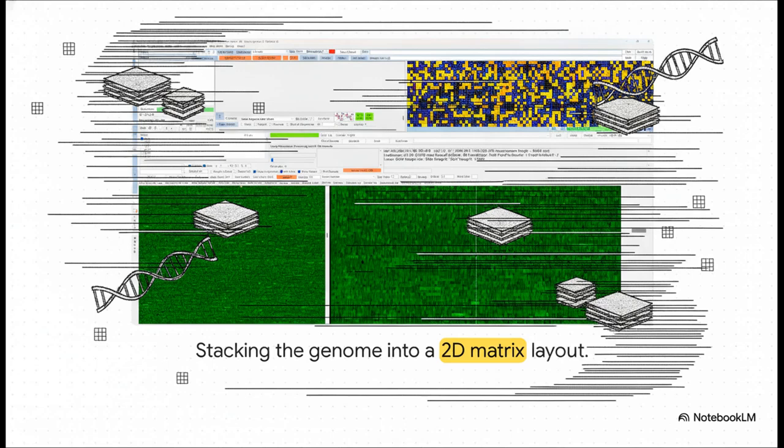Well, the browser takes that linear DNA and it actually wraps and stacks it. It reads from left to right and then drops down to the next line, top to bottom. It's actually a lot like the horizontal scan lines on a vintage TV set. By taking all that data and stacking it into a two-dimensional matrix, a spatial map suddenly begins to emerge right in front of you.